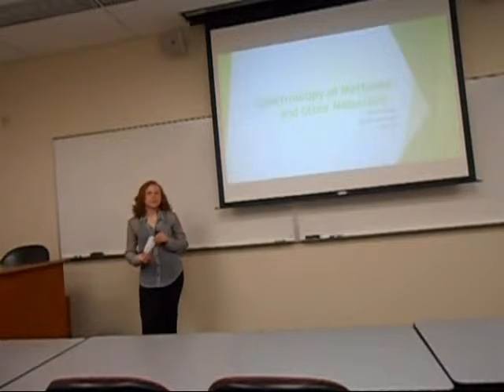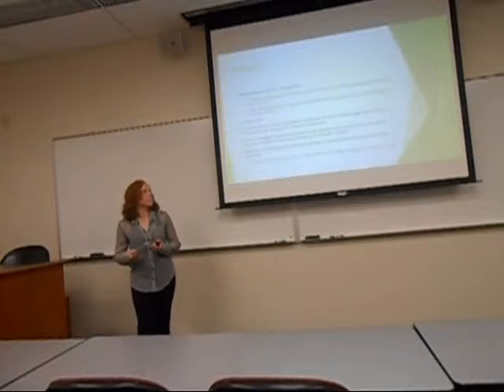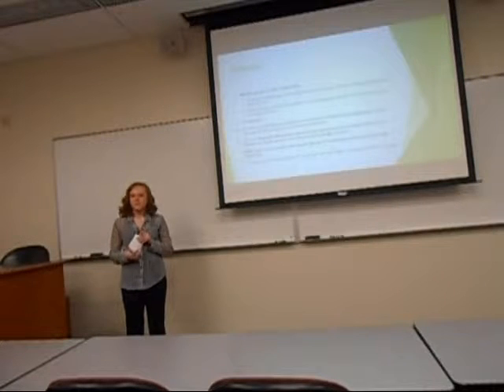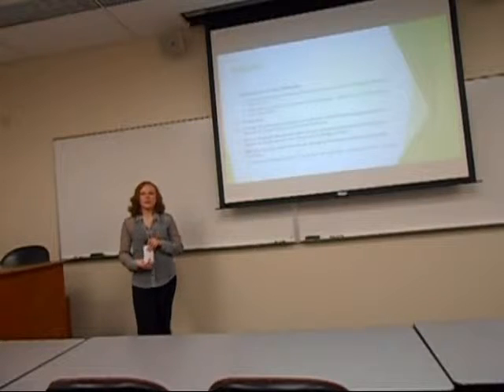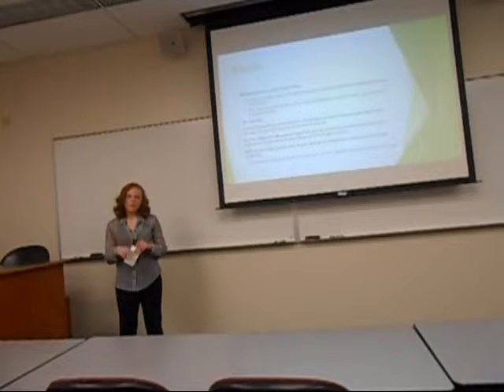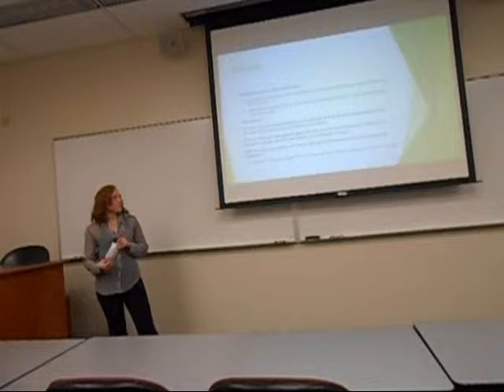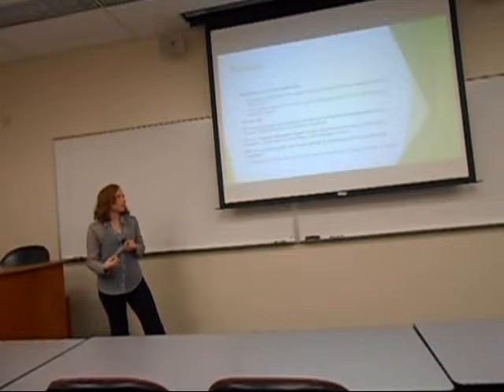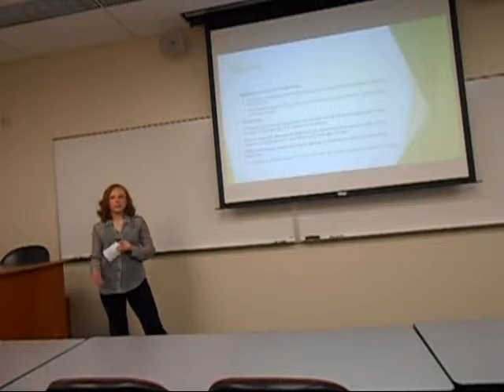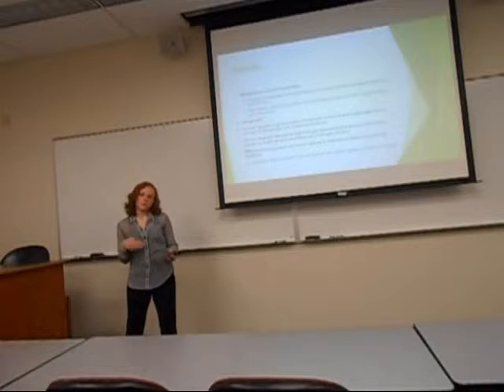Alright, so I'm Kayla Ruffner and I'm going to be presenting today on the spectroscopy of methanol and other simple molecules. In this lab, the purpose was to identify compounds using infrared spectroscopy and nuclear magnetic resonance spectroscopy. They both measure the electromagnetic radiation in molecules. Infrared is basically to find the functional groups in molecules based on their Lewis structures, while nuclear magnetic resonance is finding the number of peaks and the ratio of areas to identify those molecules using range of absorptions.